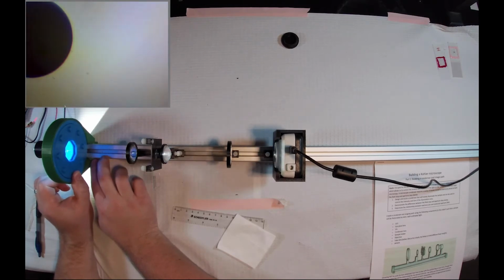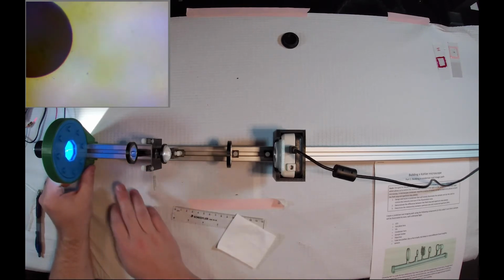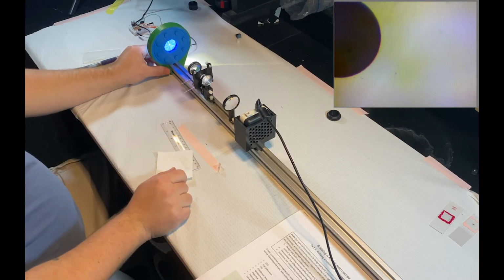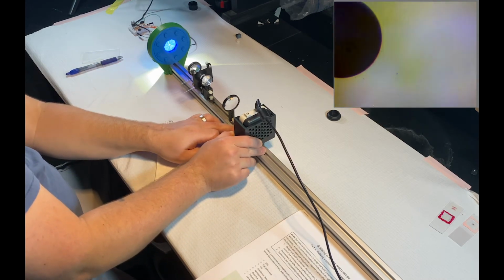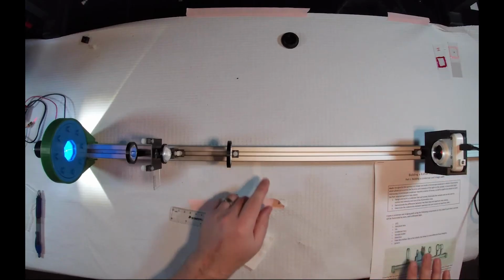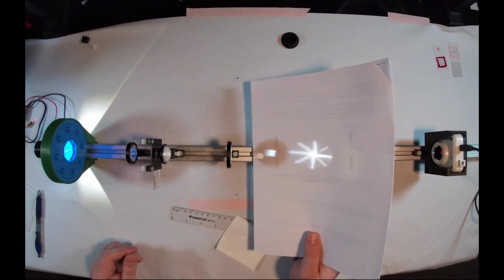So it is a little bit difficult to see on the camera itself, and that is simply because the camera is such a small field of view. So what we can do instead is I will slide this camera back, and then I'll mount sort of a small piece of paper here.